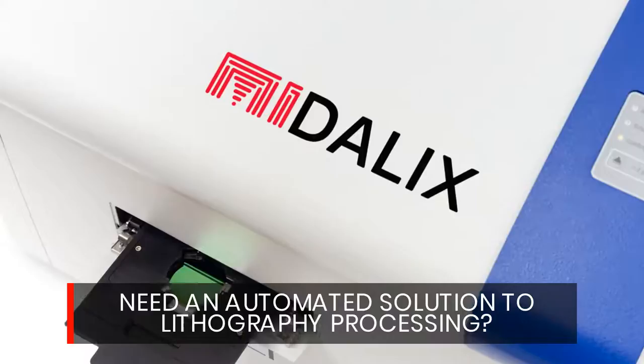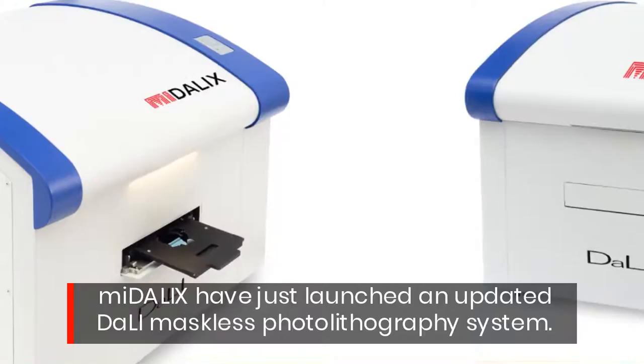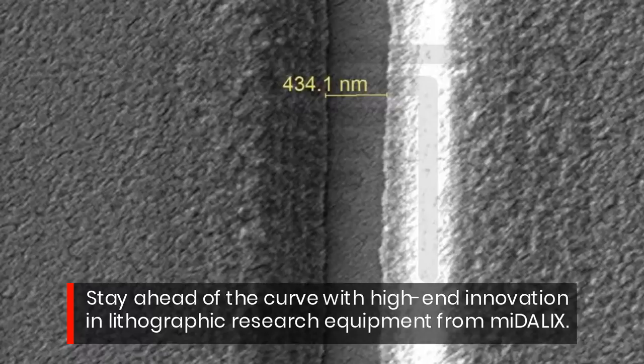Need an automated solution to lithography processing? miDALIX have just launched an updated DaLI maskless photolithography system. Stay ahead of the curve with high-end innovation in lithographic research equipment from miDALIX.